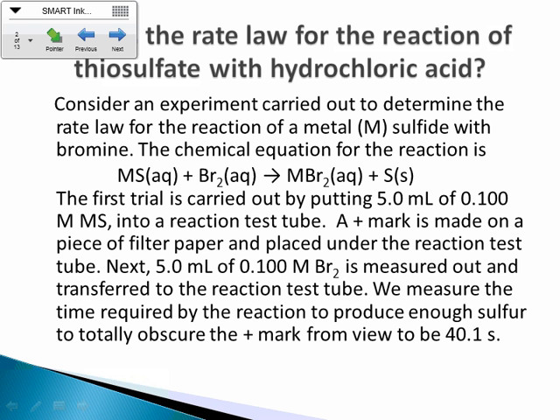I think we'll just use regular paper, because otherwise you're wasting filter paper. You put the test tube directly over the paper and look down into the test tube as the reaction occurs. I wouldn't normally recommend that, but nothing's going to spatter up at you on this one, and you'll be wearing goggles.